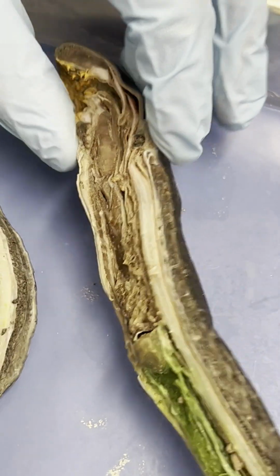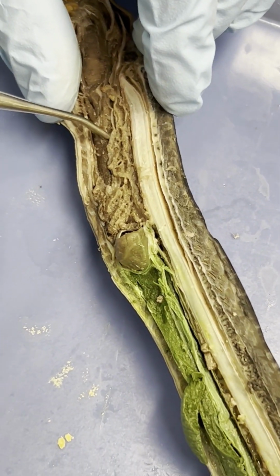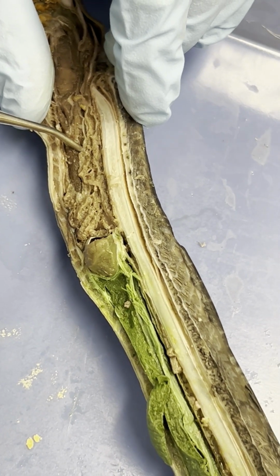Last but not least, what I have for you guys, internal structures, is our internal gill slits. Do you guys remember how many gill slits that this animal has?